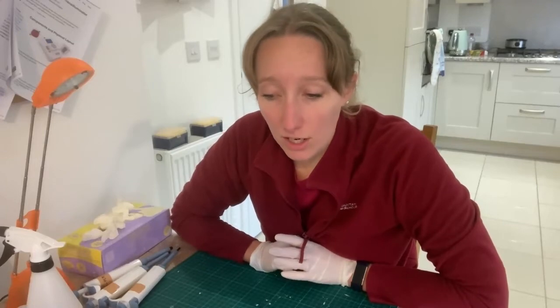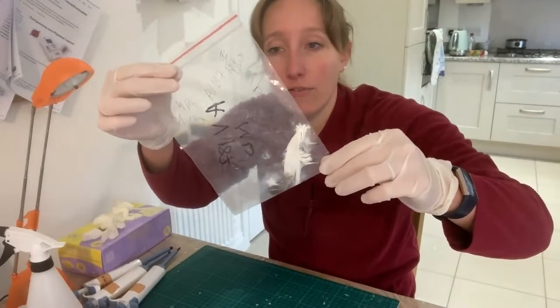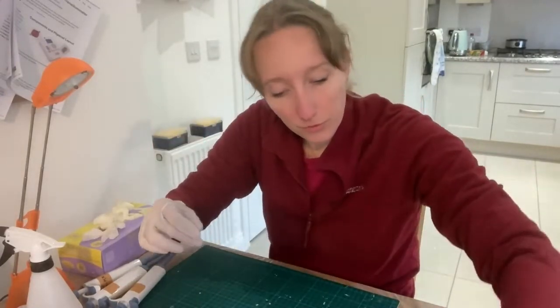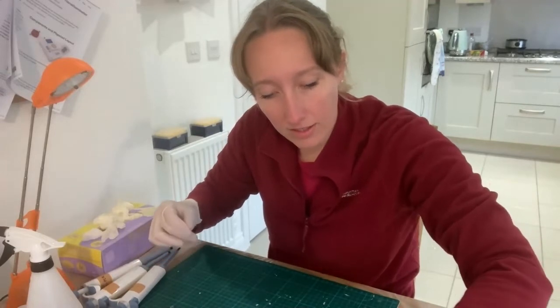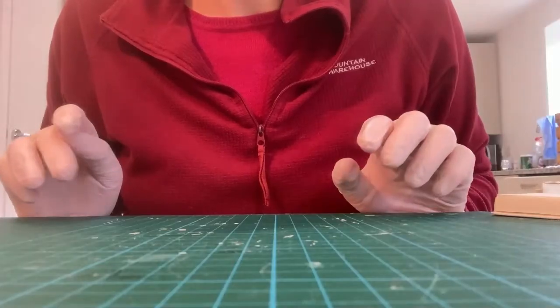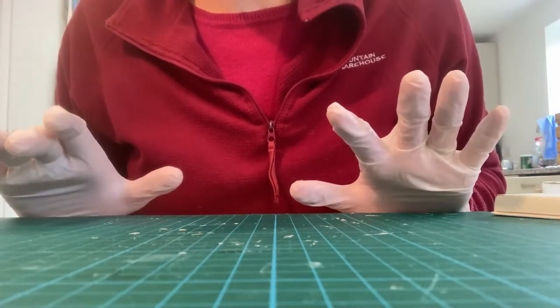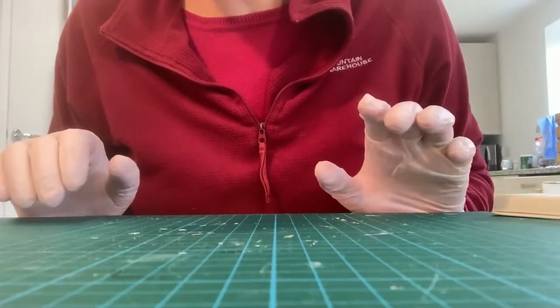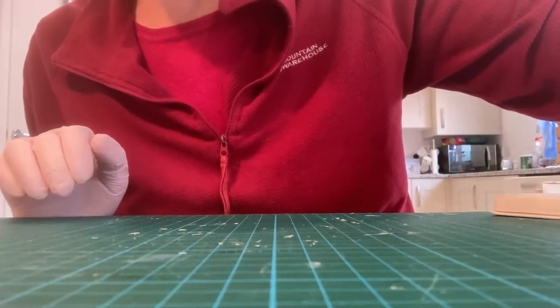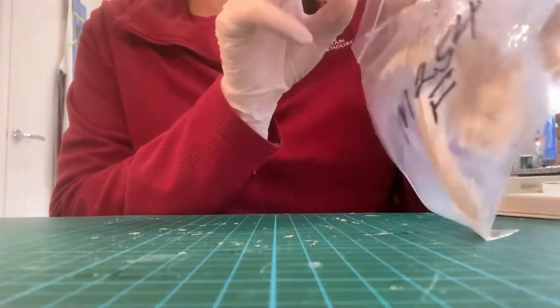I'm going to start by extracting DNA from the feathers he sent, very well labeled, and then put them through the PCR and show you the outcome. I'm going to cut up a feather on a close-up so you just need to see the feather, and I'll try to show and explain what I'm doing to get the DNA from these feathers.